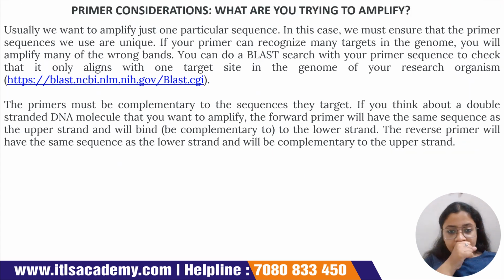Okay. Now talking about primer considerations. What type of primer we will be using will depend on the type of DNA that we are trying to amplify. What is our gene of interest, what is our target DNA?